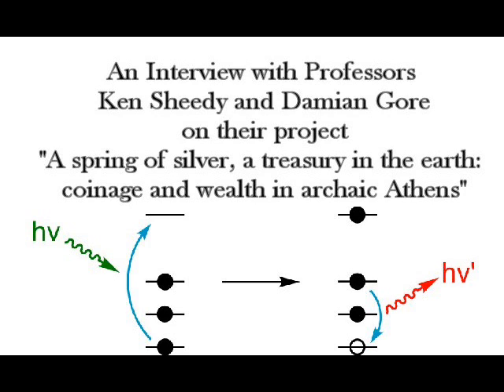But I guess more importantly, for consideration of accuracy of the technique for what we're doing, is that these archaic coins aren't debased like Roman coins. They're very pure. They haven't been deliberately silvered on the outside. So that gives us hope that the XRF is going to be accurate to start with. There's more apart from that.